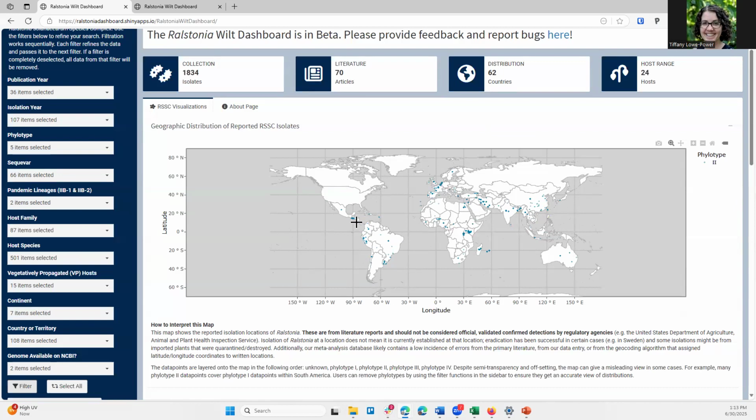The map automatically loaded. And so now instead of showing all isolates around the world, it is showing the 2B1 isolates. If there are any that are in locations that seem new or surprising, it's worth hovering over those dots and looking at the text-based metadata that shows up for each strain.